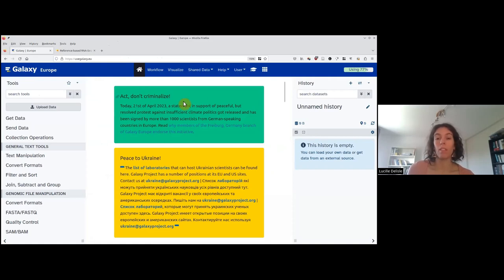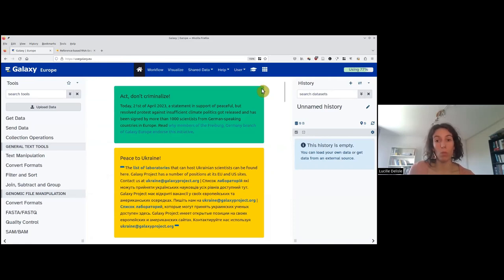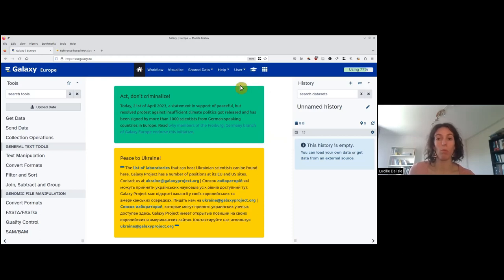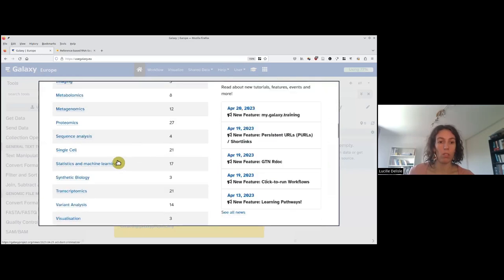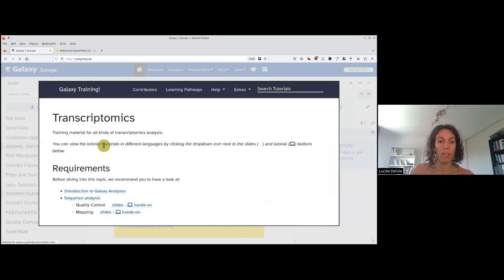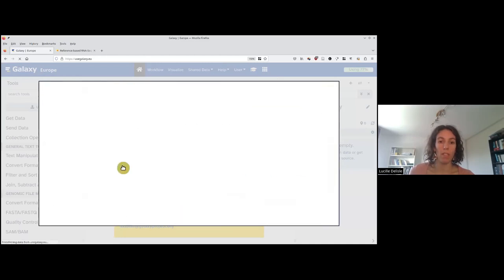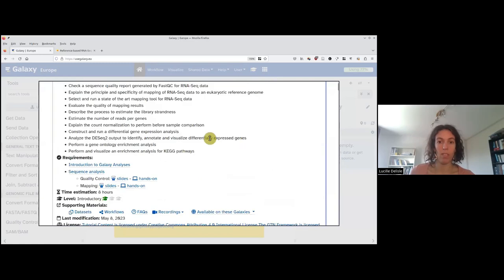Be sure you're logged in — to check it, you just need to verify that it's written 'user' and not 'login' here. If it's the first time you're using Galaxy, you need to confirm your subscription via the link in the email you received. You can also see the tutorial within Galaxy by clicking on this little hat icon. This is a mirror of the Galaxy training website, and therefore you can again go to transcriptomics and then reference-based RNA-seq data analysis and see exactly the same content.